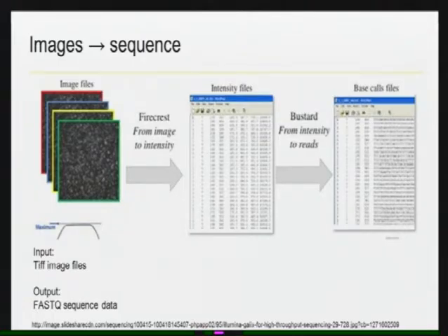But if you have some of the earlier files, you could reprocess them with the latest software, so that you could remove that batch effect. So there's a few options, but yes, it could be different. And if you had data from a GA2 and a HiSeq and a MiSeq or something like that, you would probably want to put in a batch, or I guess a technology covariate, for that data set. Other questions?